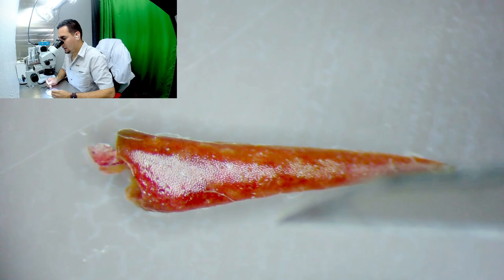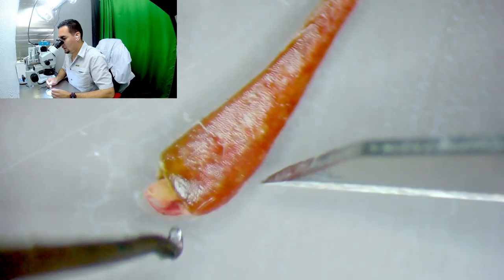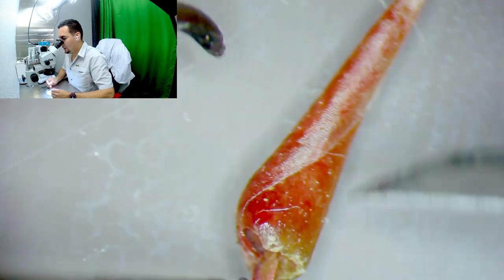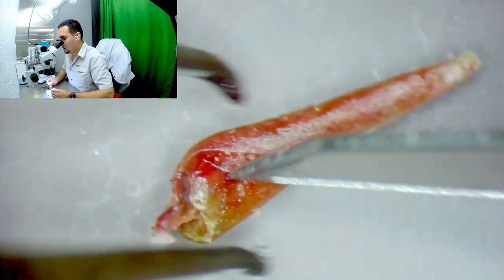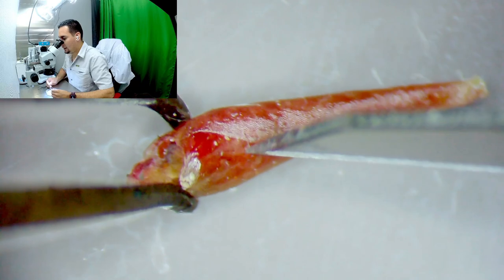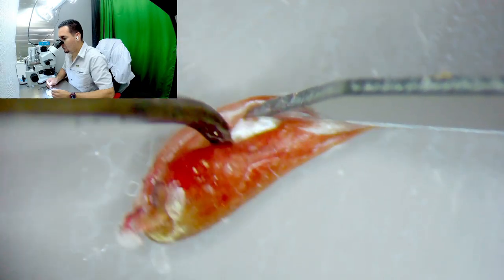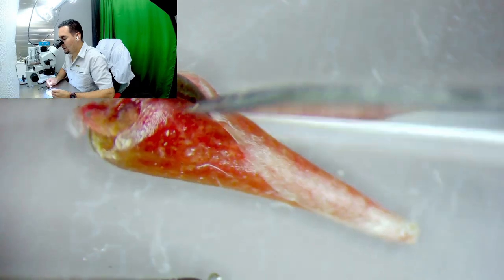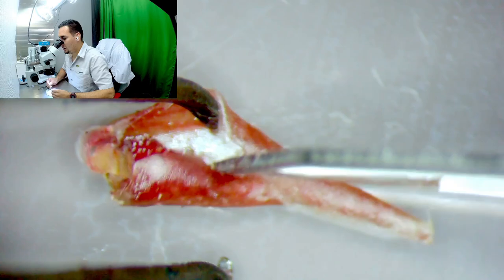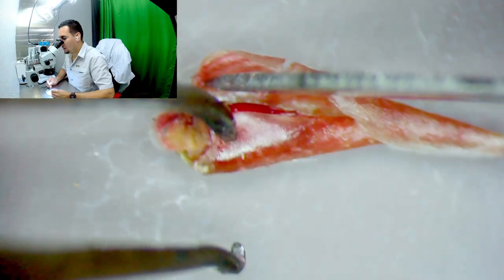For this one, what you want to do is peel all the leaves. This is the good side of the plant. I just want to grab it from here with my forceps and peel this leaf off — hold it with the forceps and peel it up with the scalpel.